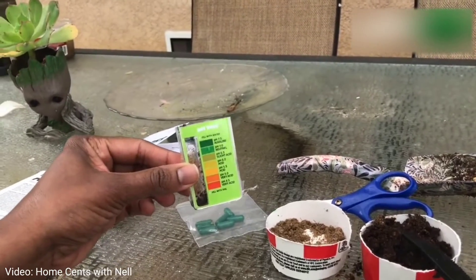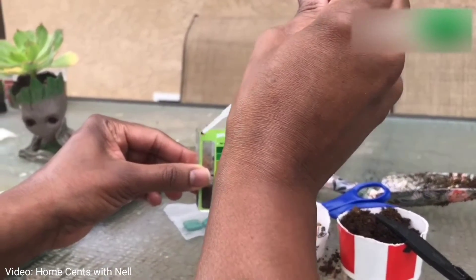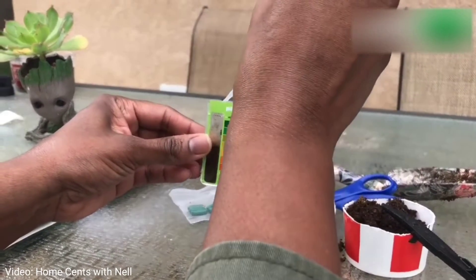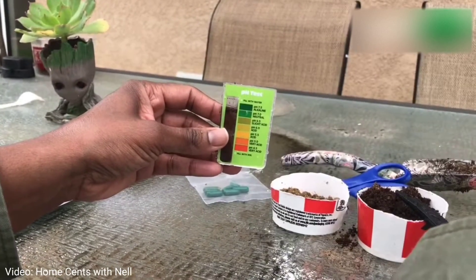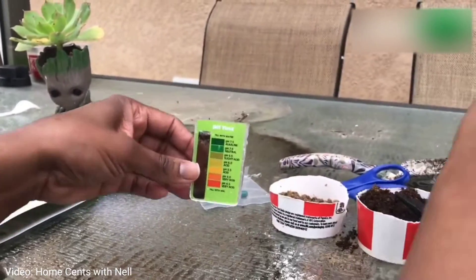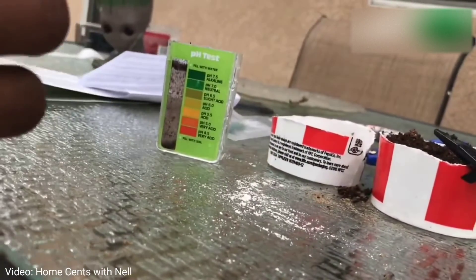I filled the test comparator tube up to the fill line and added water, and lastly I added the contents of one of the green capsules on top of the water — I forgot to add it earlier.